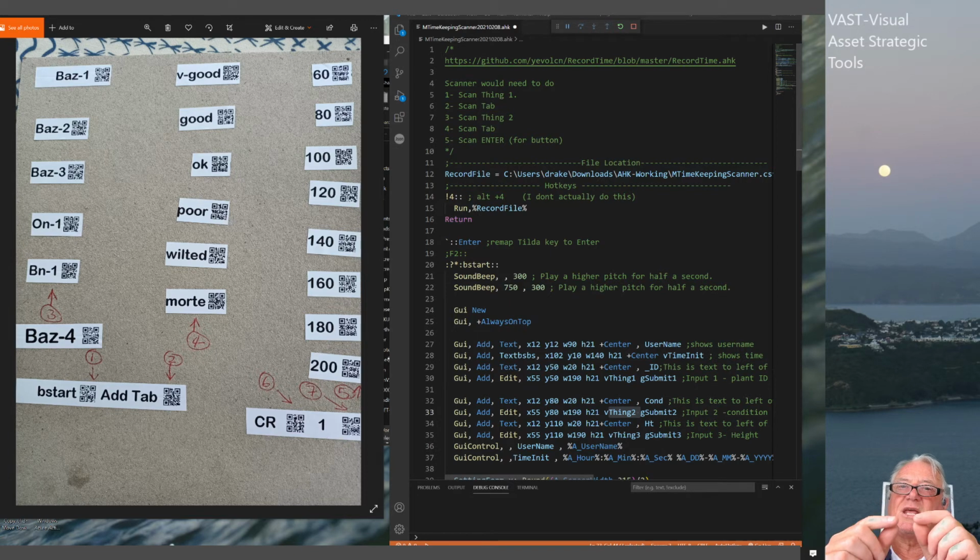But where I was thinking of AutoHotkey as just being a little intermediate program to open up something else so that I could start doing the input, it ended up being a holistic standalone program that does all that I actually need it to do. I just have the scanner and AutoHotkey scripts, and it saves everything to a file formatted as I want. The next part was that once you gathered a whole load of data, you'd need to do some analytics on it.